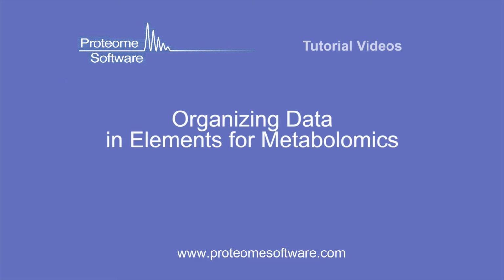Welcome to Elements for Metabolomics training video number 2. In our first video, we showed you how to publicly obtain data from the internet and then use our workflow dialog to load and process data.